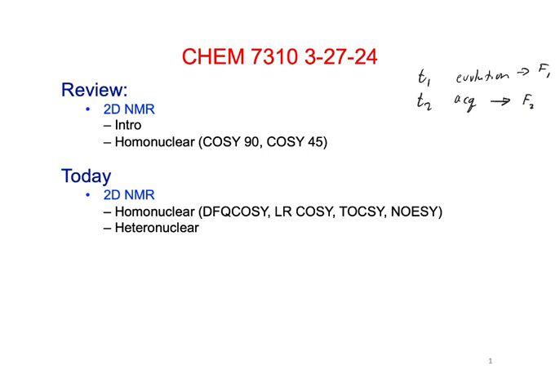And so typically the T2 domain has better resolution, because we acquire more points in our acquisition time than the number of increments that we do in that second dimension.